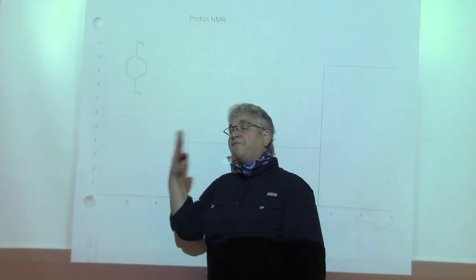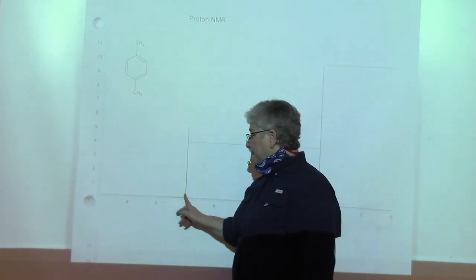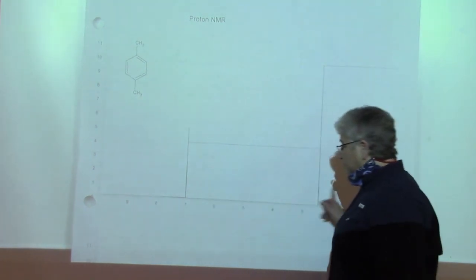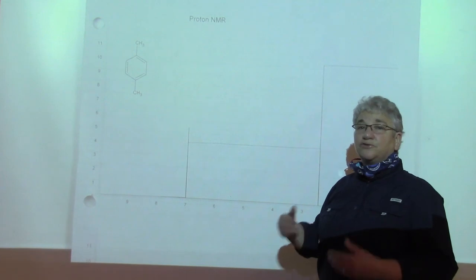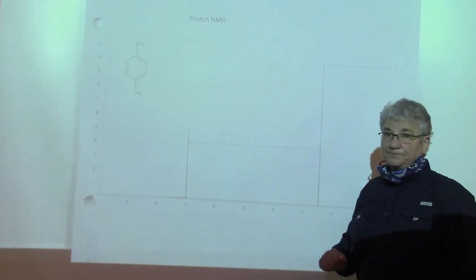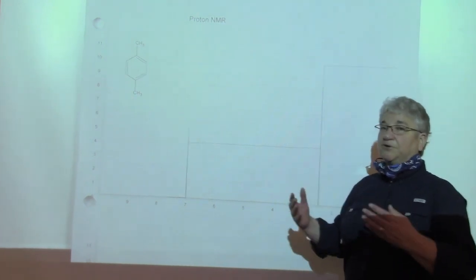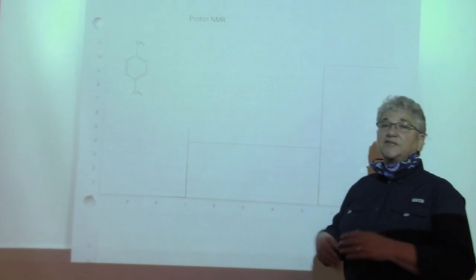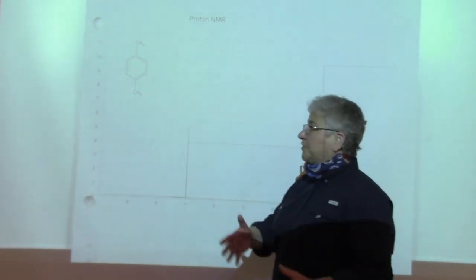But I really have 4 aromatic hydrogens, right? So really this 2 to 3 ratio, because I know my molecule, is truly a 4 to 6 ratio, right? Because 2 to 3, we're multiplying both by 2, you'd get 4 and 6. So you have to use integration with a little bit of sense.